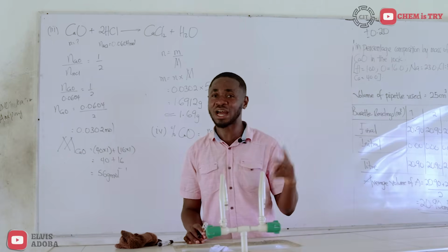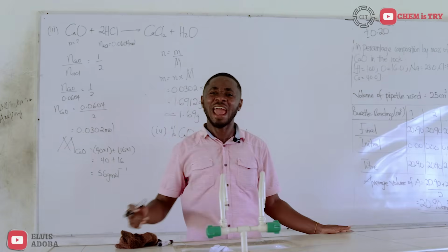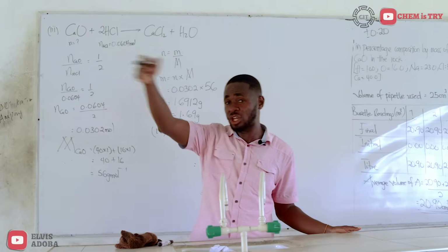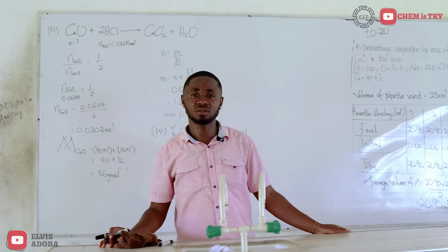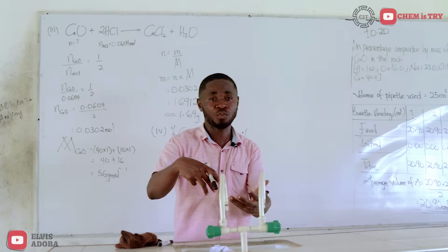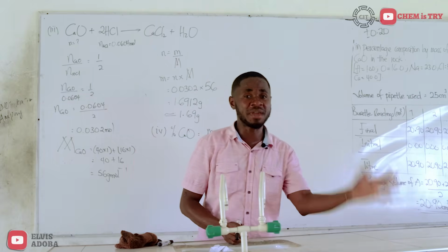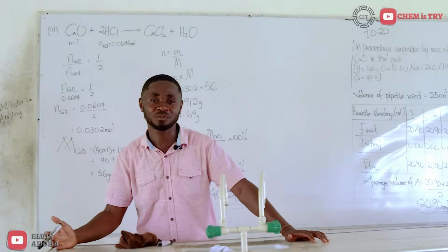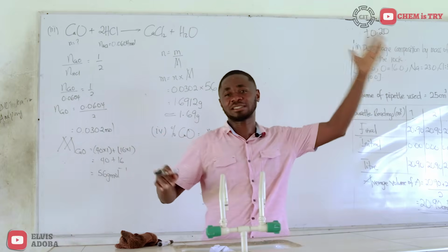Always remember, there are two reactions. In the first one, we are dissolving the impure substance in excess acid or sometimes excess base. Then the remaining acid or base, whichever one you are using, is titrated against a standard solution. So if you use an excess acid to dissolve your sample, you are going to titrate the excess acid with a standard base. If you use a base to dissolve your impure sample, you are going to titrate the excess base with a standard acid.